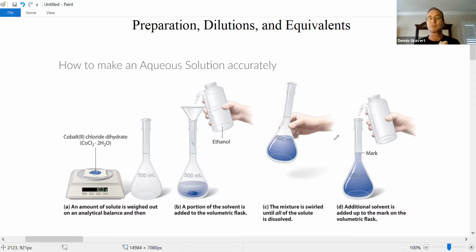It turns out these volumetric flasks are a little pricey because every single one of them is individually calibrated, meaning that someone marks them, probably with the use of a computer automated system, but anyways, one by one, they are precisely marked, and there's a mark there, so precisely we know the volume is 500 milliliters, and at least 1 decimal point.